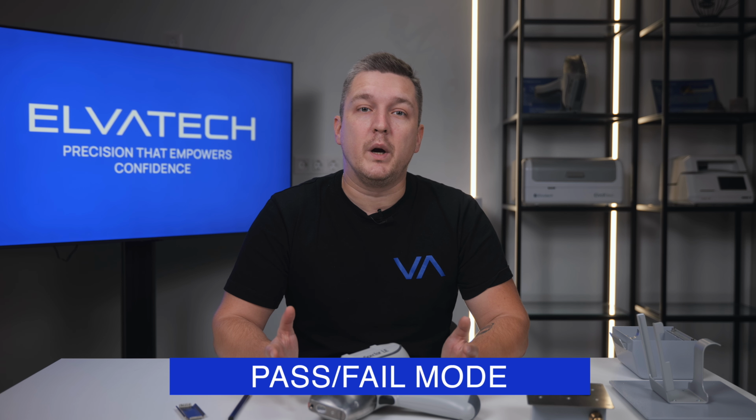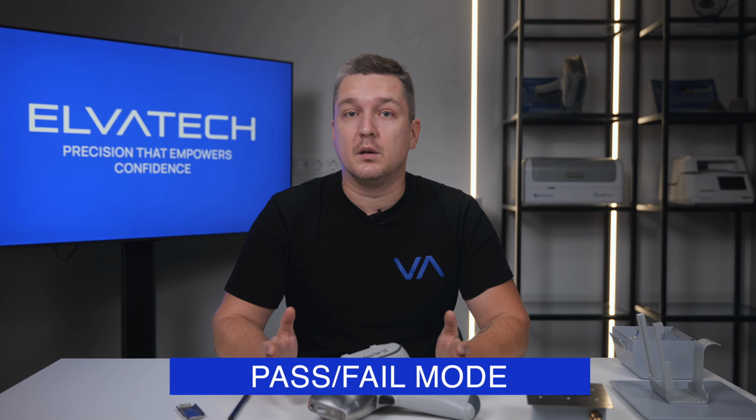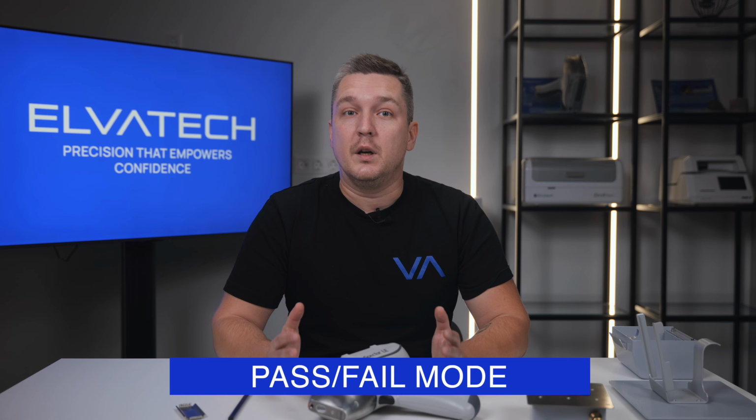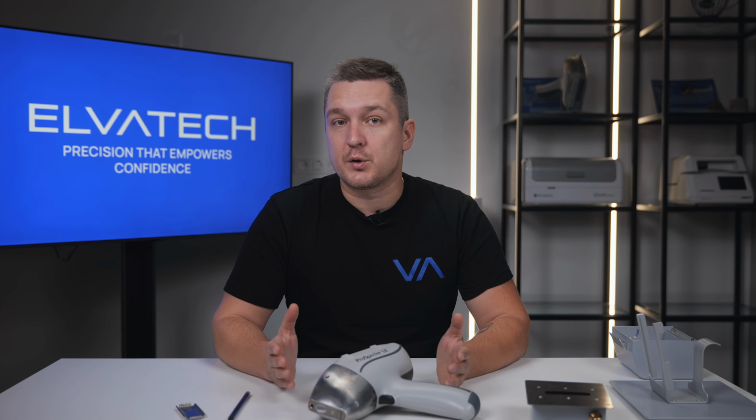And finally, the Pass-Fail mode. It gives a quick answer on whether the sample meets the standard. If it is within tolerance, pass appears on the screen. If not, it means fail. This mode is ideal for sorting large numbers of samples in the field.